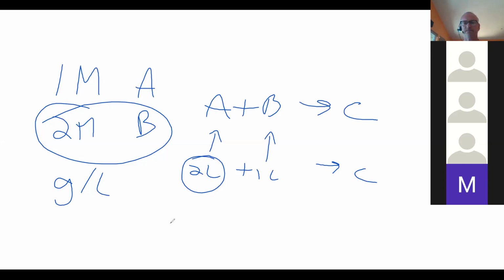Yes. Okay. So this is the reaction we're going to be doing. So we're going to have arsenate in solution, right? So we're going to have a certain amount of that in solution. And what we're going to be doing is adding a solution of silver nitrate.